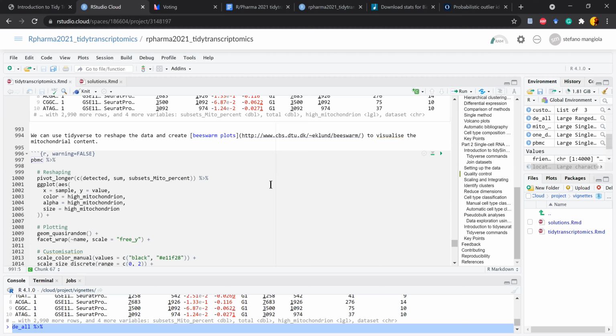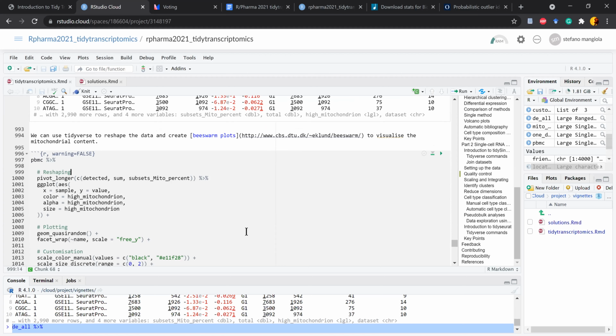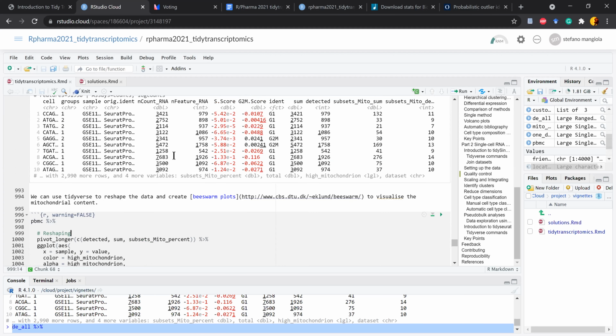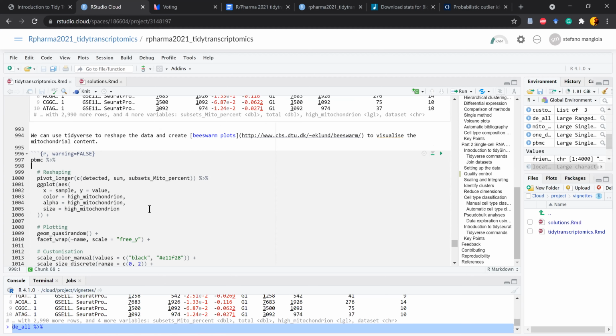But for the sake of this tutorial, I will show you how we can reproduce the same visualization in a custom way with particular aesthetics that we might want to use for publication. And because this is the table abstraction, it is very natural to use ggplot for this. And it basically comes for free with the use of tidySingleCellExperiment.